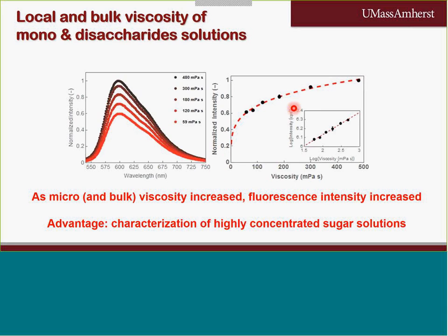Very interesting sensitivity of these molecular rotors to the restriction caused by increasing viscosity, particularly for mono and disaccharide solutions. So, an interesting advantage in comparison to conventional rheometers, because most shear rheometers cannot test viscosity of highly concentrated sugar solutions because the shear causes crystallization and they cannot give an accurate measure.